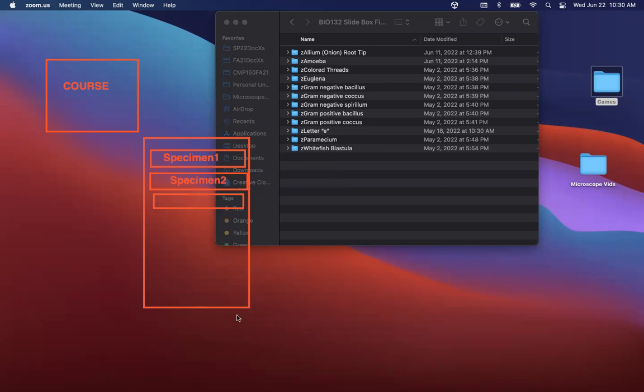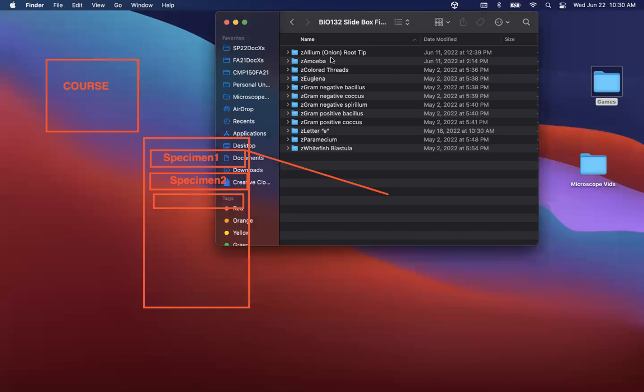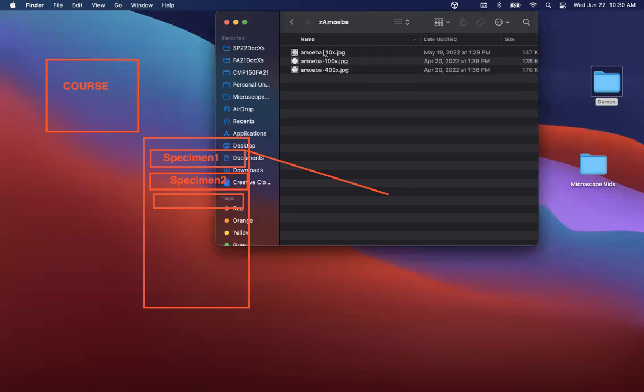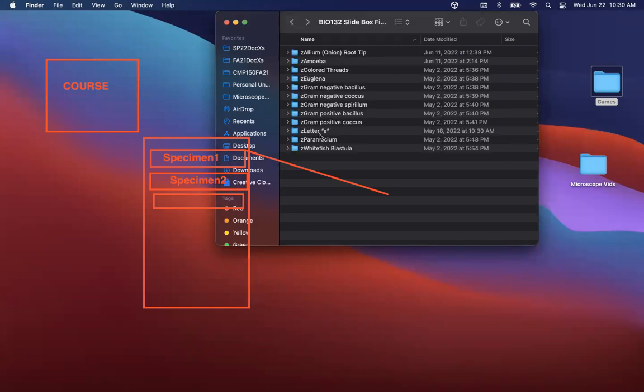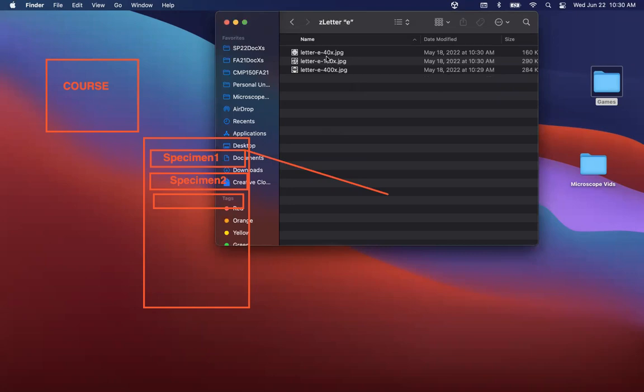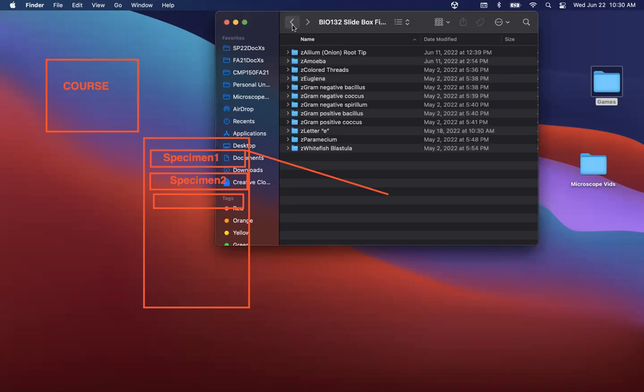And within each specimen, of course, the specimen is going to have one to three pictures inside of it. So if I were to go inside of this amoeba, we see that it has three pictures here, or the letter E, it has three pictures, right?